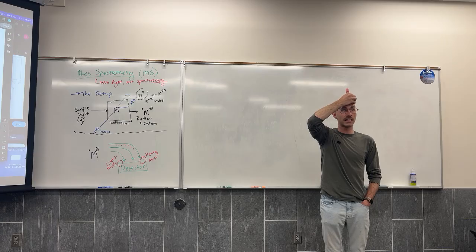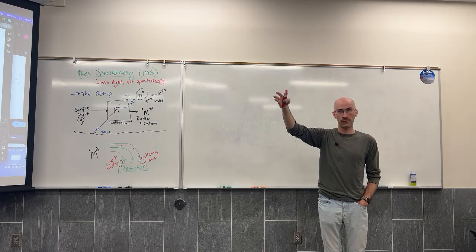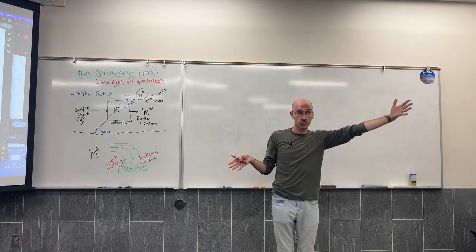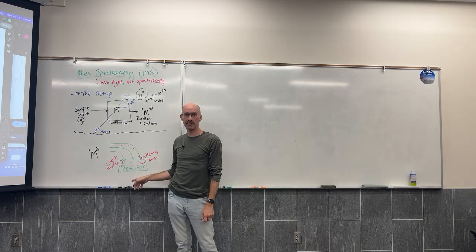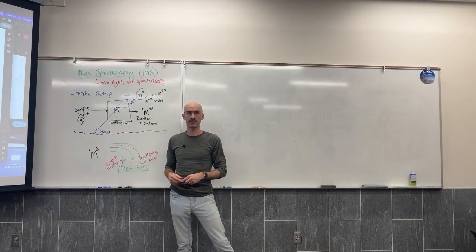What it actually does is it spans a strength of magnetic fields. It starts with a very small magnetic field, and then it goes to a very strong magnetic field. At a very small magnetic field, only light things hit the detector. At a very strong magnetic field, only heavy things hit the detector.